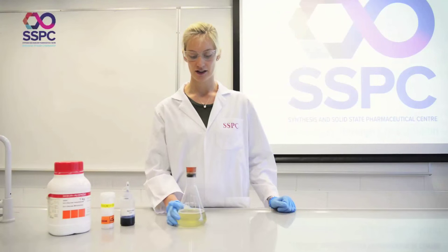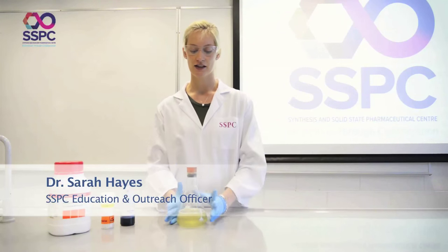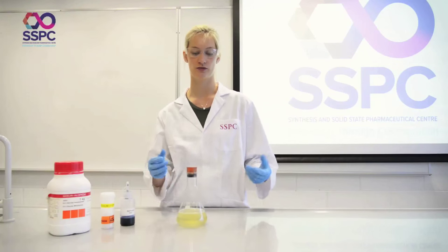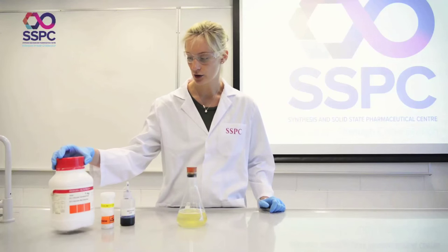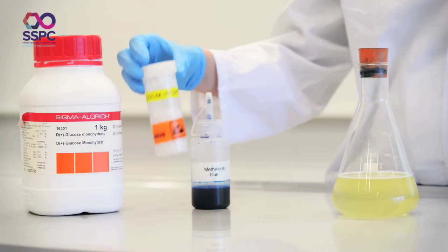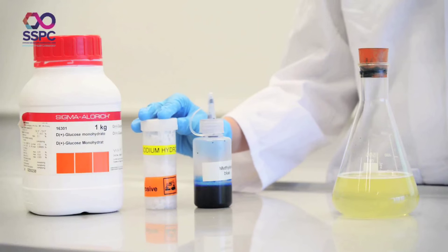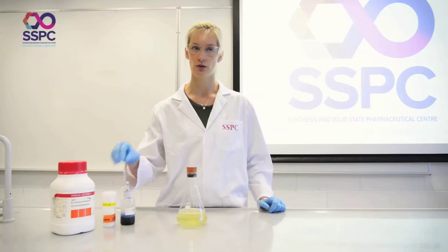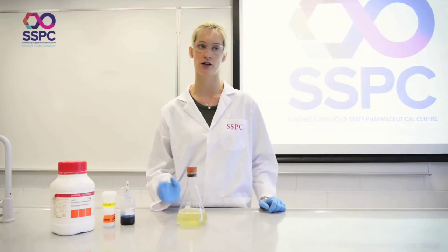We refer to this as the blue bottle experiment, and it works best when you present it as a problem to a group of students. I've prepared this using glucose, sodium hydroxide, and methylene blue solution. An important thing to note: when adding sodium hydroxide, you always add it to an excess of water — not the other way around. You add sodium hydroxide to water, not water to sodium hydroxide.